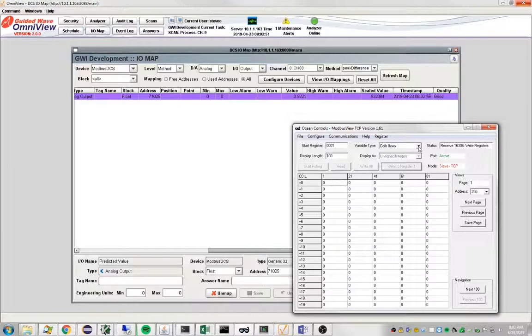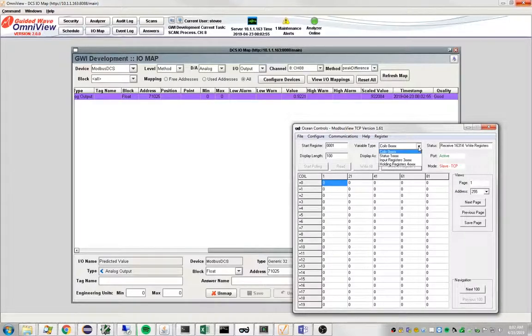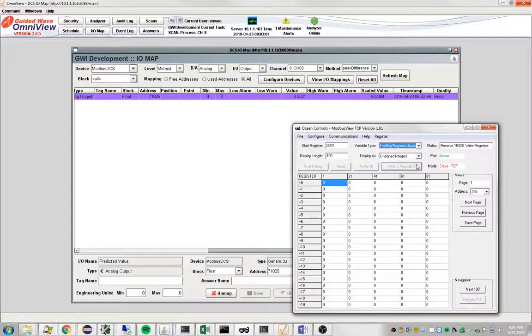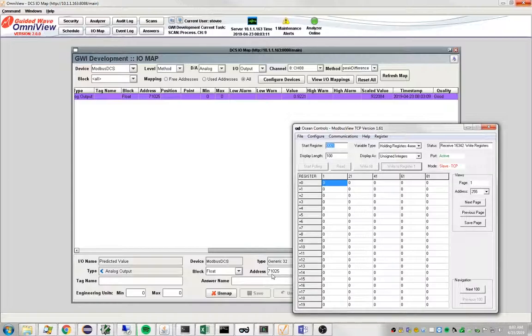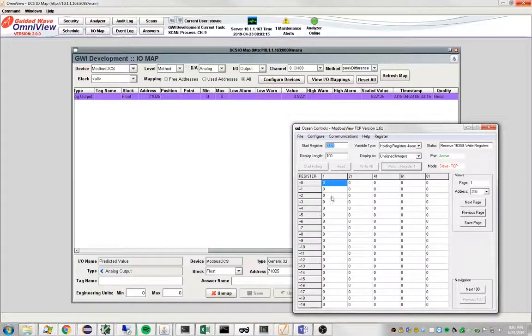To see our number, I have to do a couple things here. I need to go to holding registers and I need to go to the right address. Our address that we use in Omniview is 71025, but we subtract 70,000 from that so the address is really 1025.